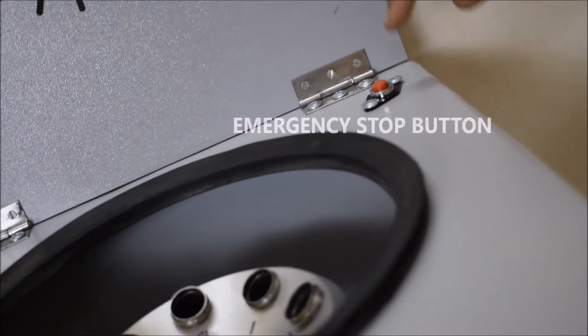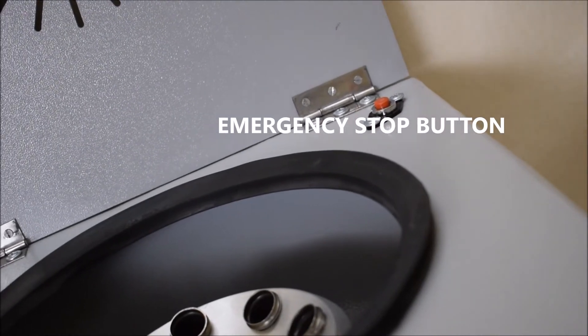As you open the machine, you will find a red small button on the left side of the machine. That's the emergency stop button.